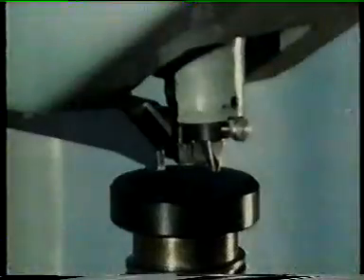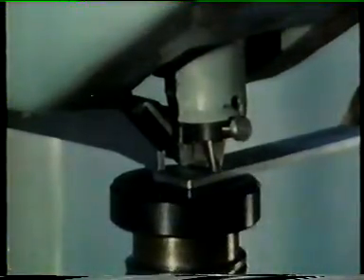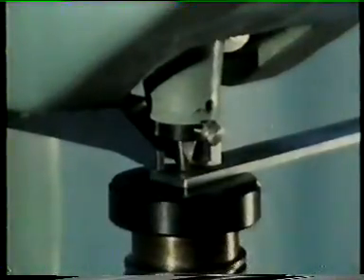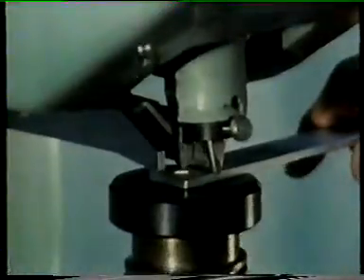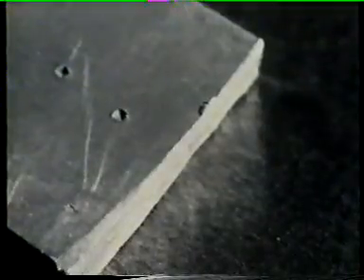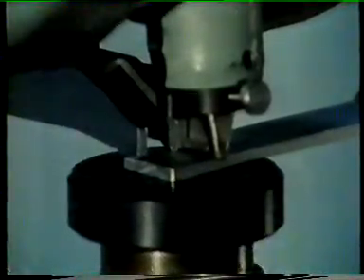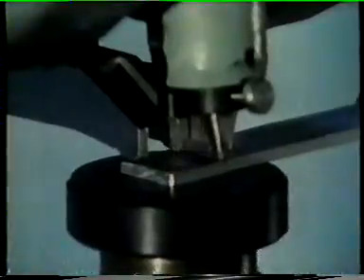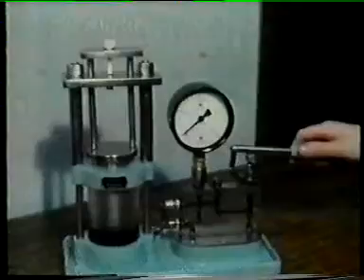Now let's see what effect this has had on the mechanical properties of the aluminium. Hardness, for example. Here we're measuring the resistance to indentation of a piece of cold-worked aluminium. How does this compare with the size of the dent produced in a piece of recrystallized aluminium? It's much deeper, so recrystallization has restored softness.